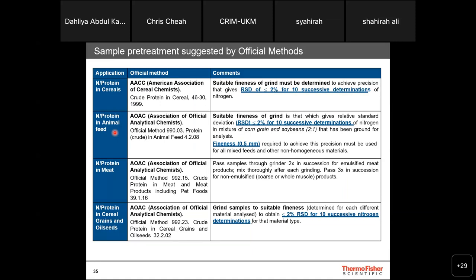There are a lot of big companies in our region, and also the Europe region, manufacturing animal feed. They improve quality in terms of the protein level. When we determine protein digestibility, it has to do with nitrogen content. With the higher content, they can refer to that as maybe a better quality, then they can sell at the higher pricing. This is how instrumentation is being utilized to improve the quality of their product so that they can market it better.